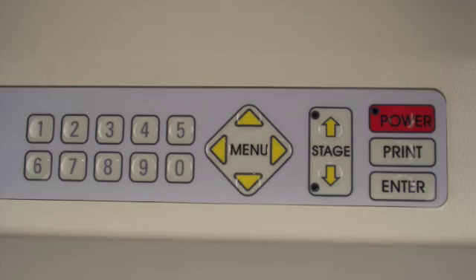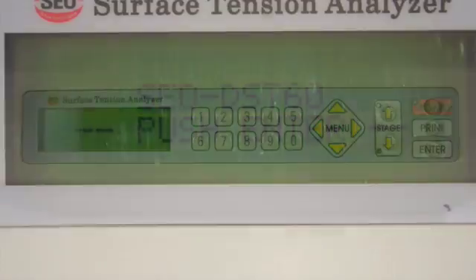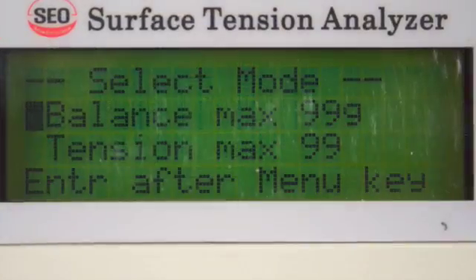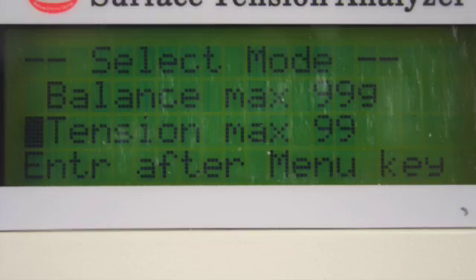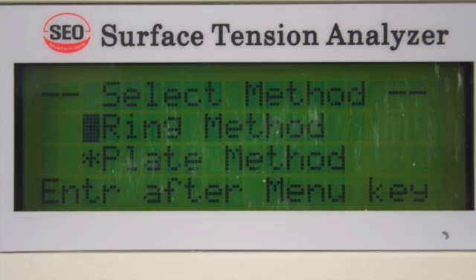The simple digital keypad layout makes operating the DST-60 easy. To begin testing, the operator simply presses ENTER on the keyboard and then follows the command prompts. Select tension measurement to begin a test, then choose the Denoy ring method or the Wilhelmi plate method.